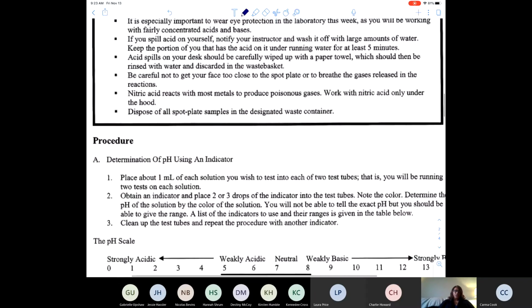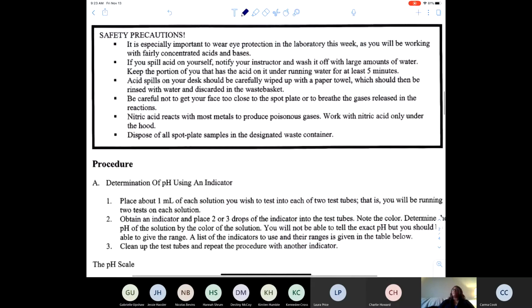And so we're going to use 3 acids in our chemical reactions of acids with substances. We're going to be using hydrochloric acid, HCl, and then sulfuric acid, H2SO4, with 2 different samples of that H2SO4 at 2 different concentrations.